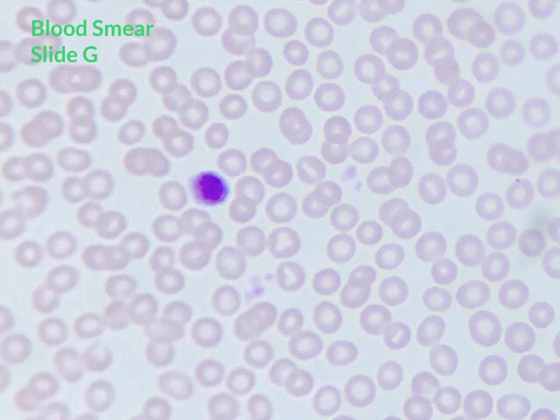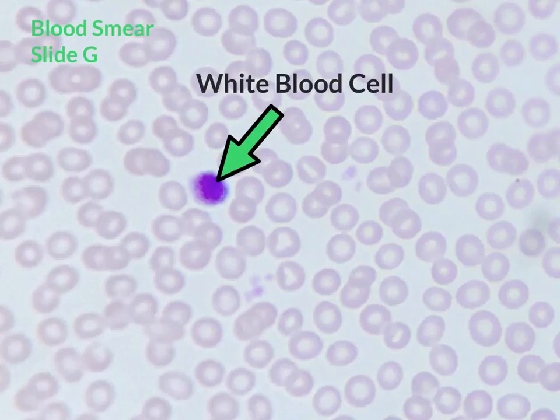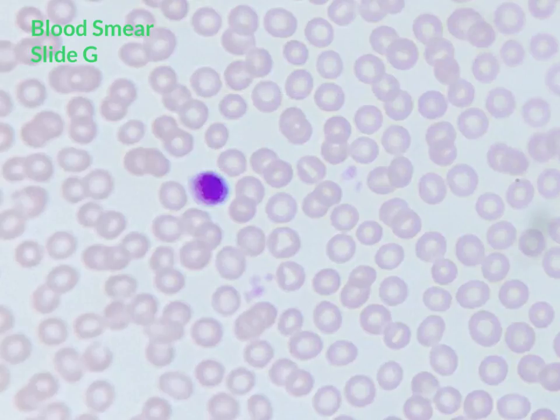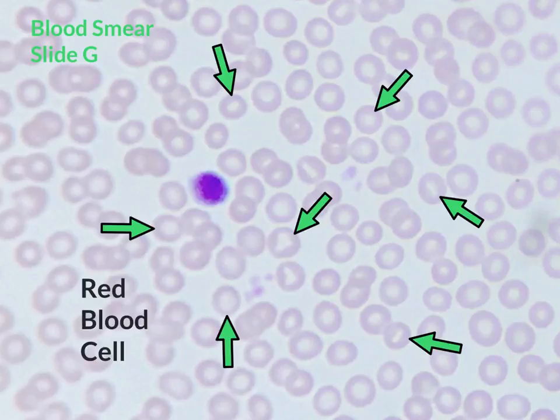The next blood cell is the white blood cell, which is the purple spherical structure shown here. Its function is to protect the body against pathogens. Finally, the last blood cell is the red blood cell, which looks like tiny little O's. The function of the red blood cell is to transport oxygen and carbon dioxide between systems and tissues.